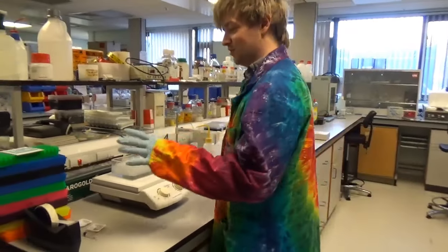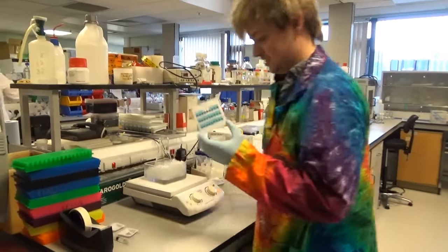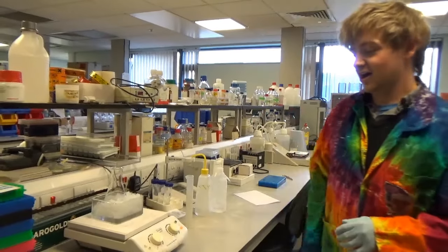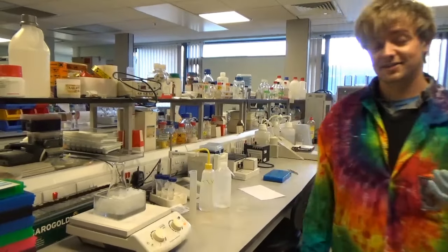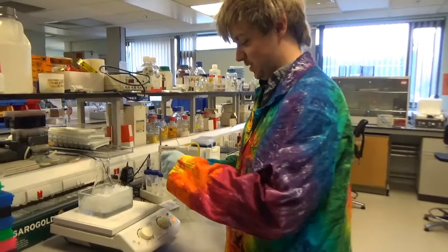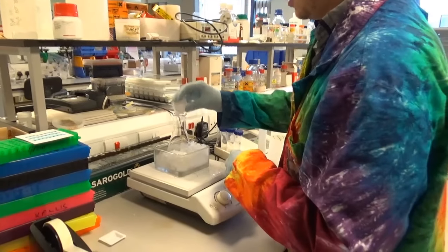Before I can put the DNA on my electrodes, which all come like in the card, I have to modify the surface. To do that, I'm currently using a diazosulfonic acid, but I have to do some chemical synthesis to turn it into that. So this is what I start with. This is the pink mush. That's just water in there, it's just dissolved it.